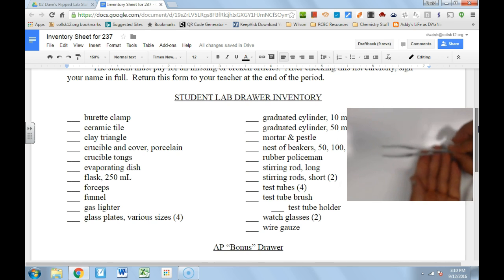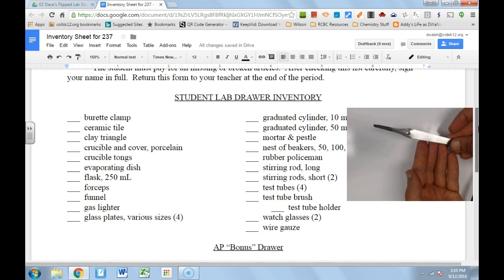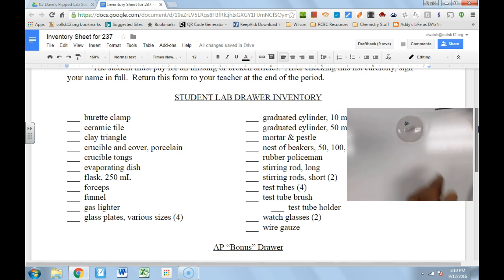Next we have our forceps — metallic friends. Forceps are very good for picking things up. You can use them like tweezers — another name for this tool — good for grabbing things, particularly things you don't want to touch with your fingers. And then we have a funnel — I won't insult your intelligence by telling you what we do with the funnel.